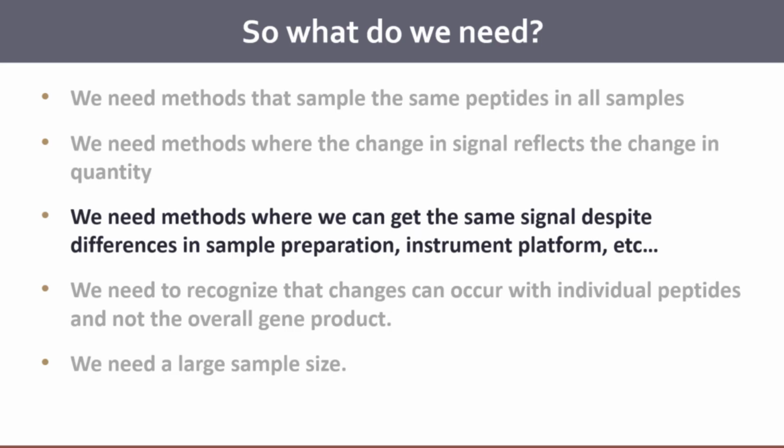It's actually an external tool in Skyline. You can install it from the tool store. What he did that was different is he actually used independent acquisition data to train whether or not you'll find something in a targeted experiment. That tends to work much better.